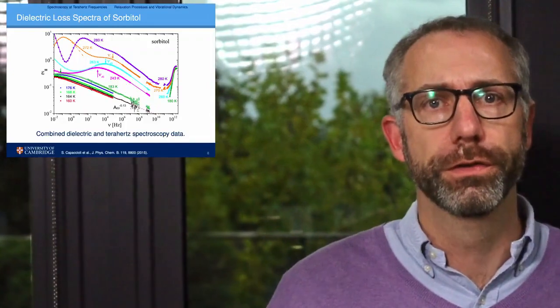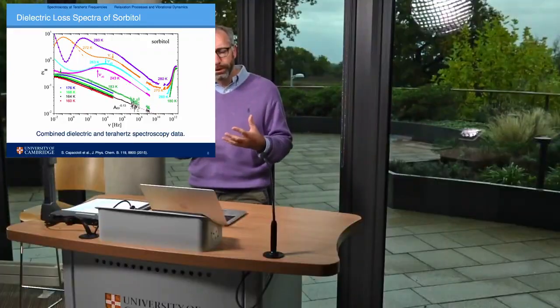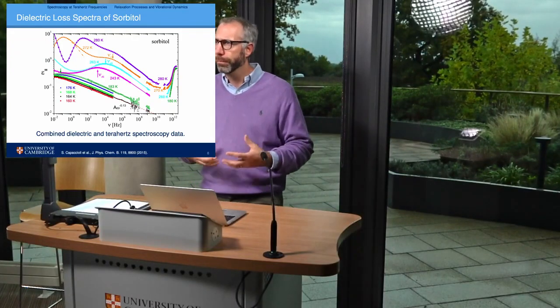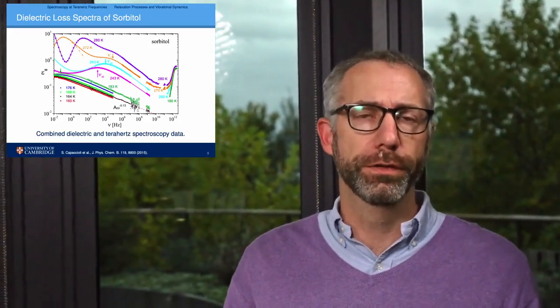This is not too surprising, considering the fundamentally different nature of the motions underlying the different spectral features here. The dielectric relaxation processes, of course, are thought to reflect the highly cooperative molecular motions, such as hindered rotations and translational motions in the condensed phase. And their relaxation times are often found to correlate well with, for instance, viscosity.